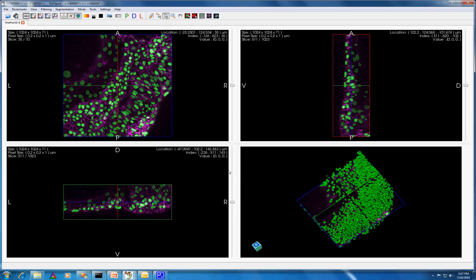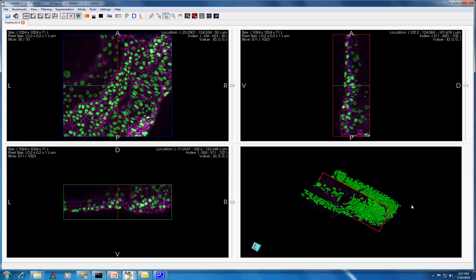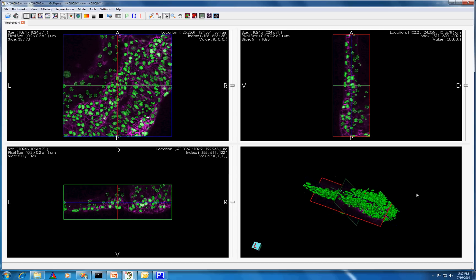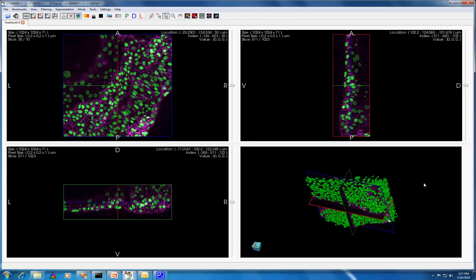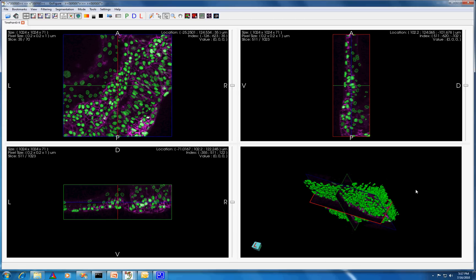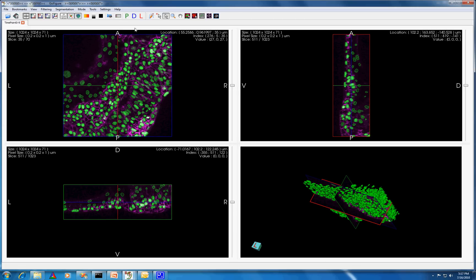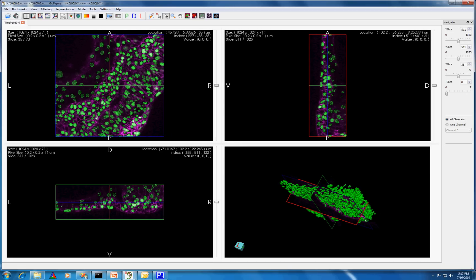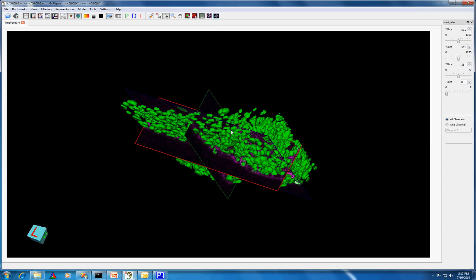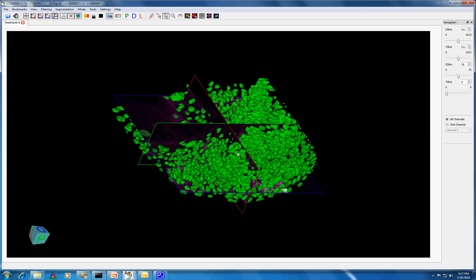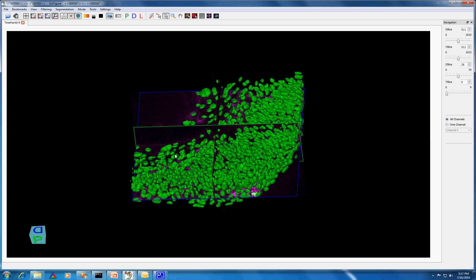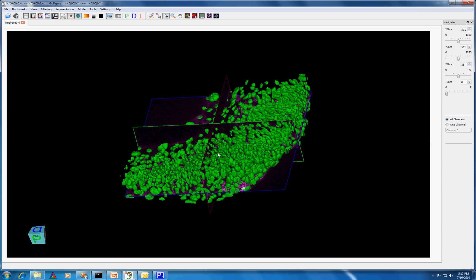This dataset shows a 3D volume of a portion of a developing zebrafish, focusing on the ear. We can see with the Navigation widget that this dataset has 9 time points and 70 z-slices. For time point zero, we have imported the results of a nuclear segmentation algorithm previously run on a cluster outside of GoFigure.